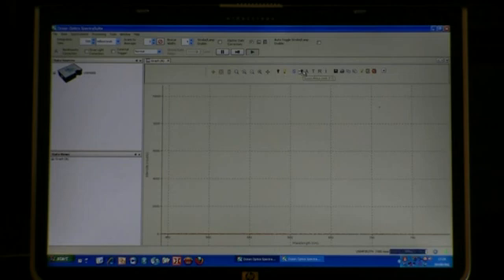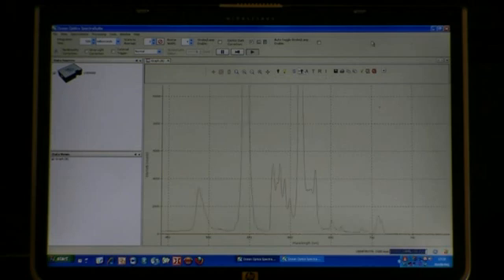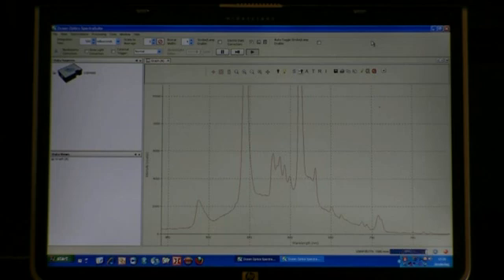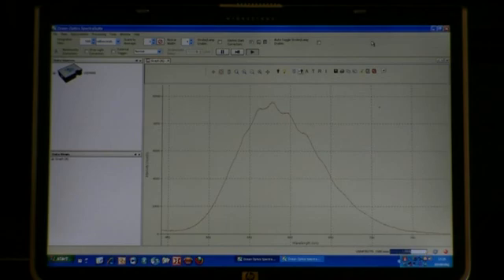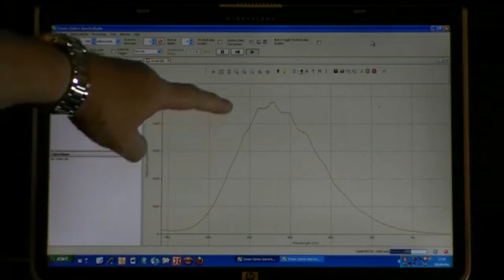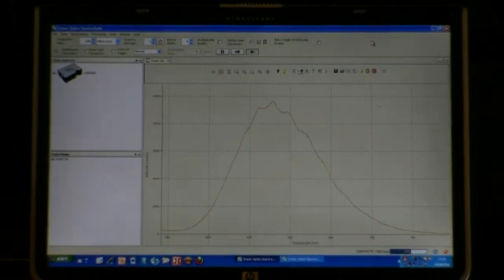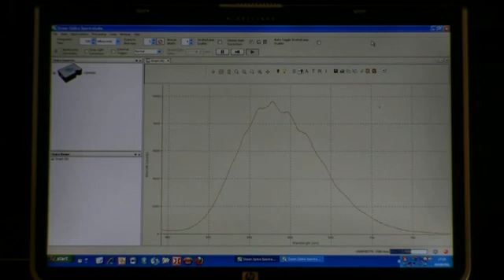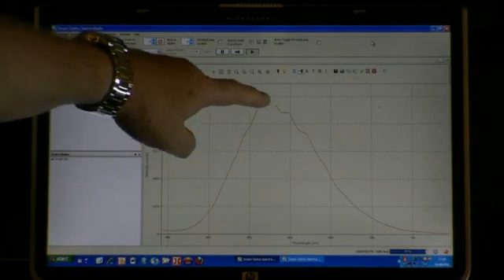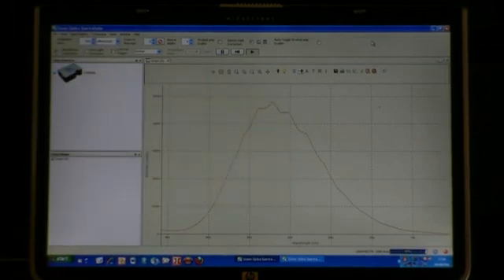Now we are actually measuring the spectrum. I insert the optic fiber and we instantly get a nice spectrum, as you can see. A very nice spectrum which obviously shows the activator of this scapulite mineral, which is the disulfide ion. We can recognize it by the numerous oscillation peaks of this typical activator.